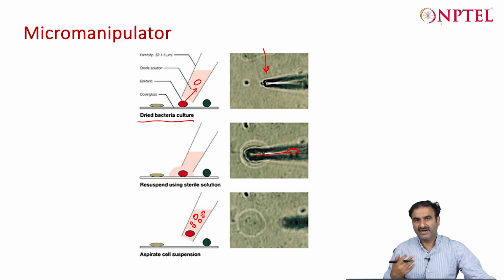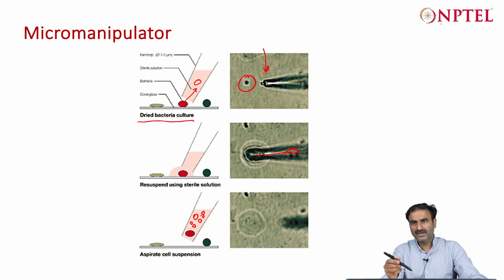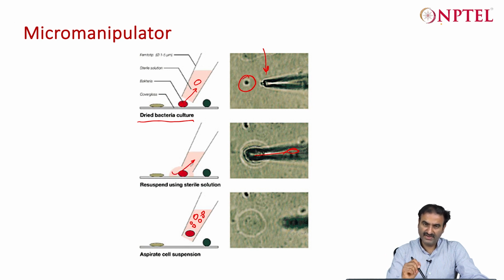You should pick at least 100 or more cells to go for complete genome amplification for a single bacteria. Basically, under the microscope you are viewing the cells. This is one cell that you have found. You will bring your microcapillary, which is a very thin tube-like structure attached to the micromanipulator, which is adjusting the pressure, and you have a joystick also. You will be picking the cells from here, which will go in and stay inside the microcapillary.